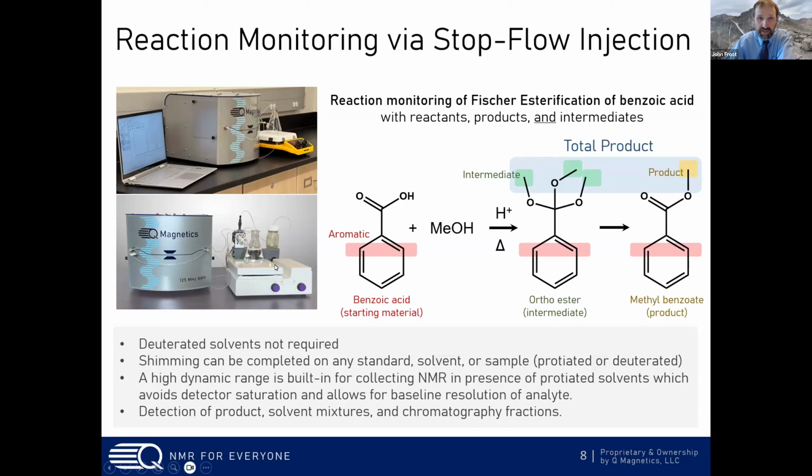So in this case, I had previously this is an SSI from Teledyne M1 class pump, and this is just a 4-port 2-position switching valve with a universal actuator from Vici Valco, and was able to bring these pieces of equipment, which I already had on the shelf.